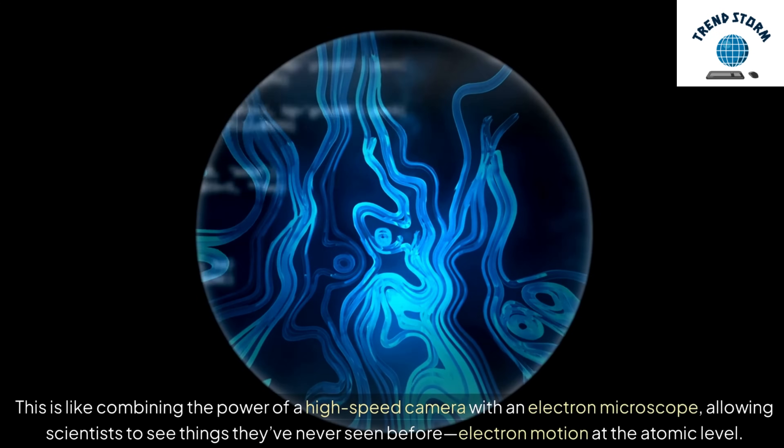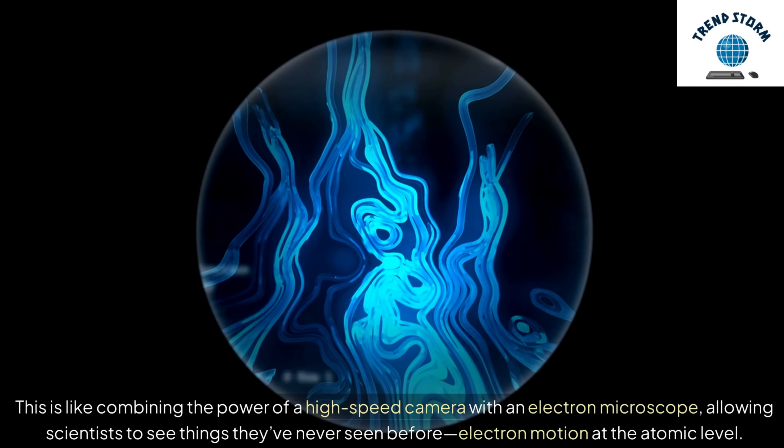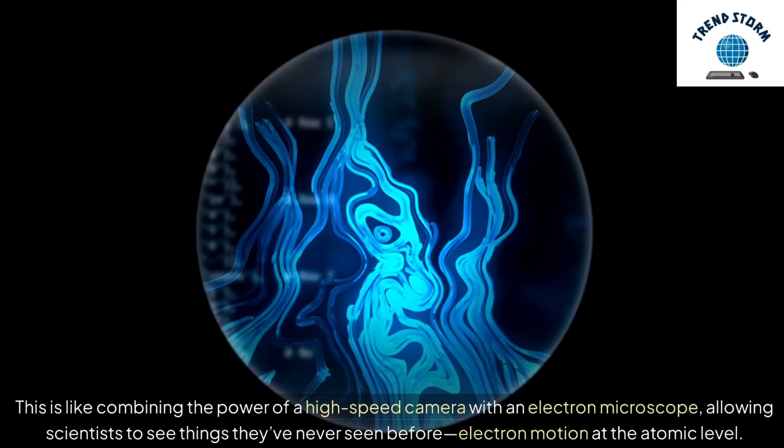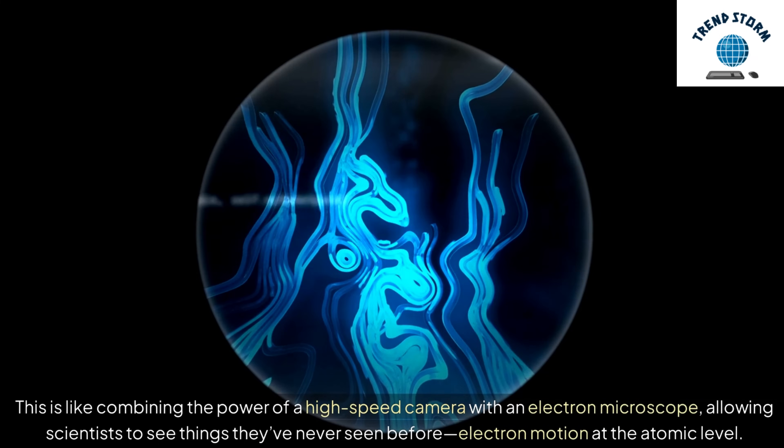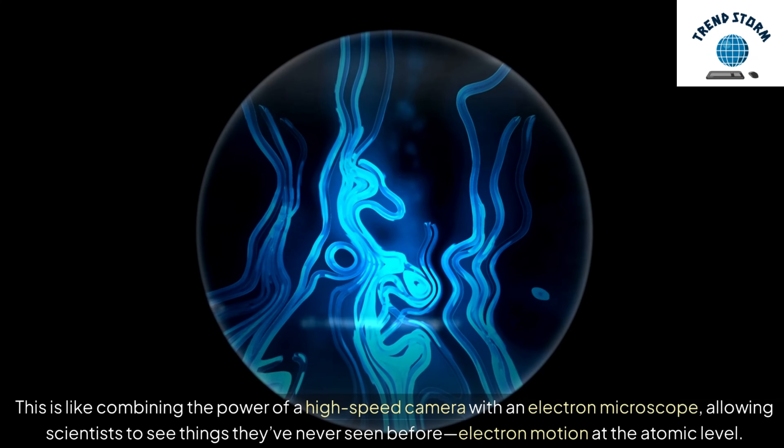This is like combining the power of a high-speed camera with an electron microscope, allowing scientists to see things they've never seen before: electron motion at the atomic level.